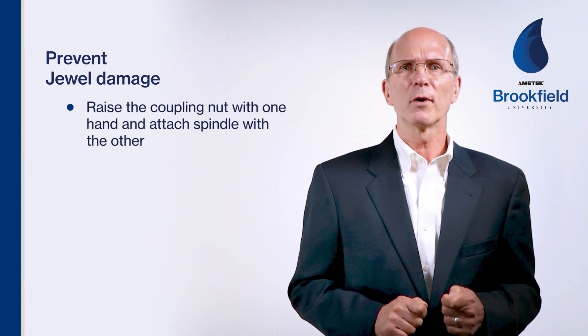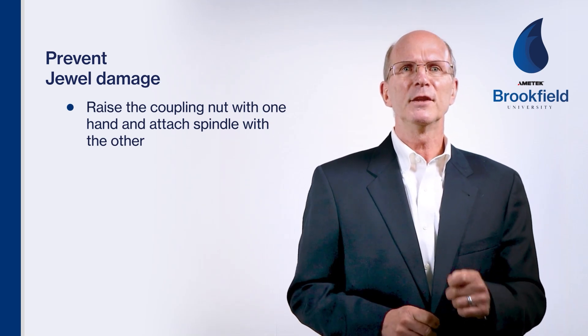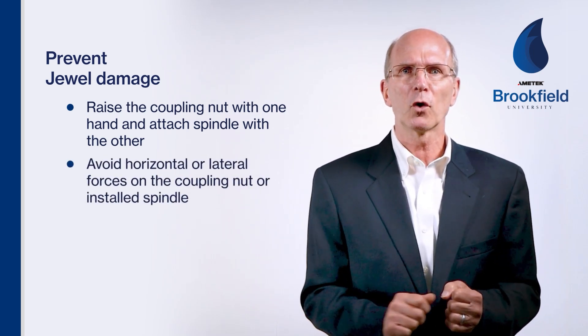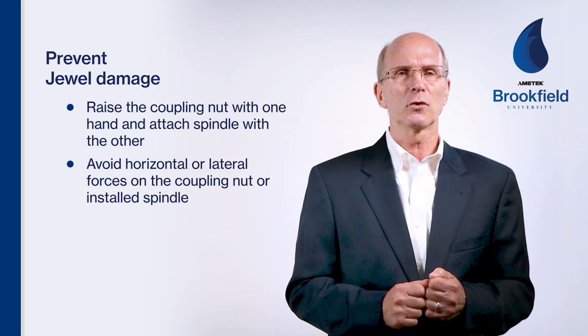To minimize or prevent jewel damage, it's important to learn this lesson when attaching or removing the spindle. All operators should be taught to raise the coupling nut with one hand and attach the spindle with the other hand. This method will minimize or prevent jewel damage. Equally important, avoid horizontal or sideways force on the coupling nut or installed spindle. This can damage the jewel and bend the spindle shaft internally.